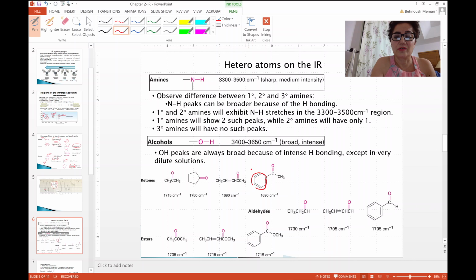For the carbon, we get a peak at 1600 and another one at 1500, between 1400 and 1500. The CO double bond is at 1700, and the CH from an sp3 hybrid would be slightly less than 3000. The hydrogen attached to an sp2 hybrid would be slightly higher than 3000.